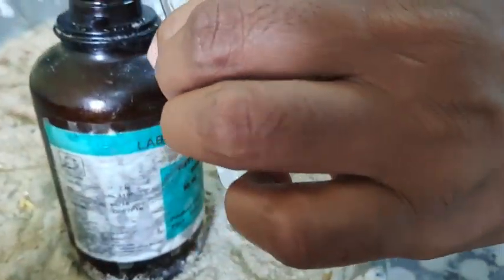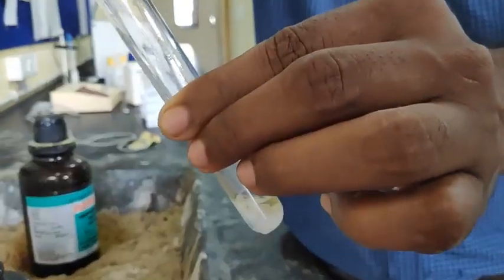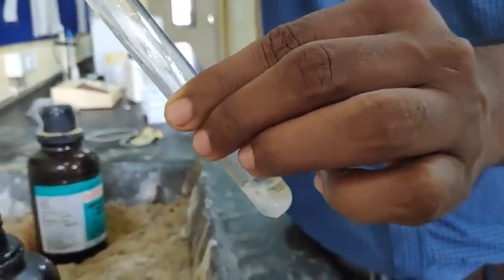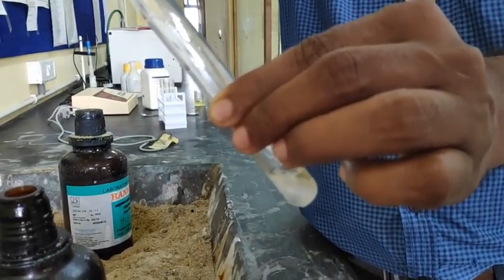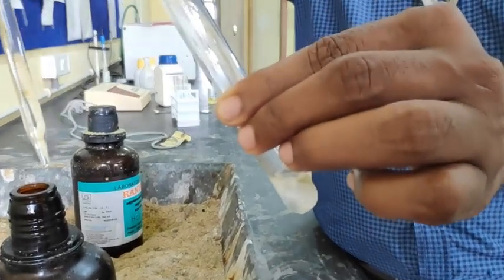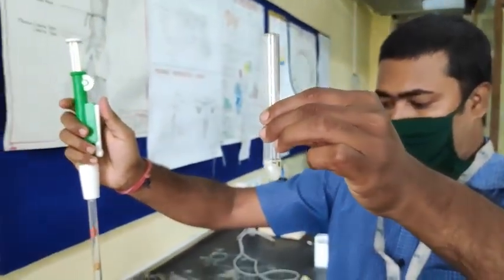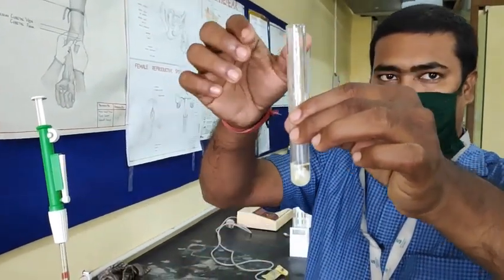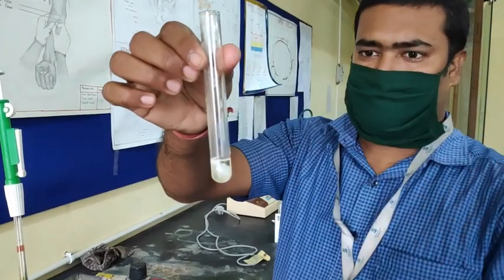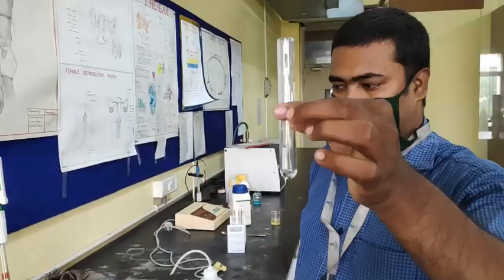Can we see this result? Yes. I think you can now see that as soon as the nitric acid has been added, there is a small amount of white precipitate occurring right here. This is one of the major tests that we can see. We can say this is a confirmatory test for protein, so with this test we can say that protein is present in the sample.